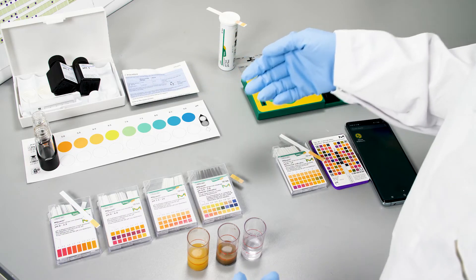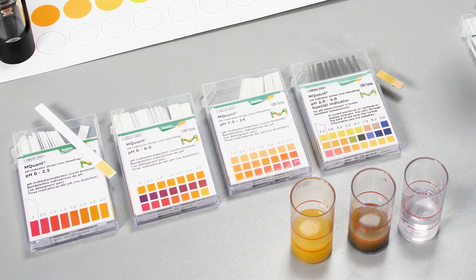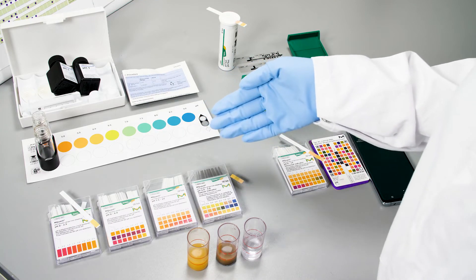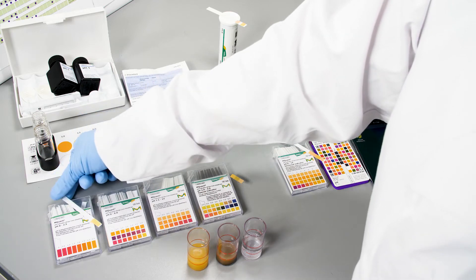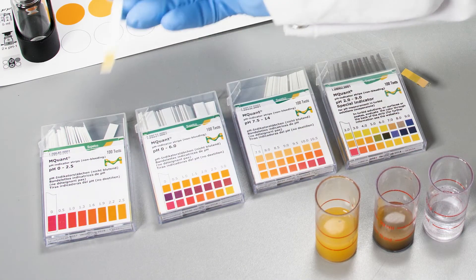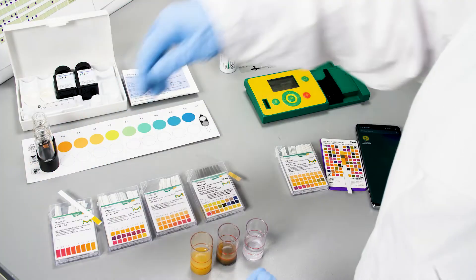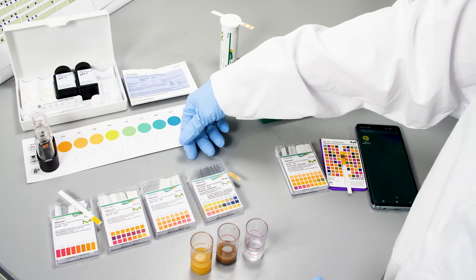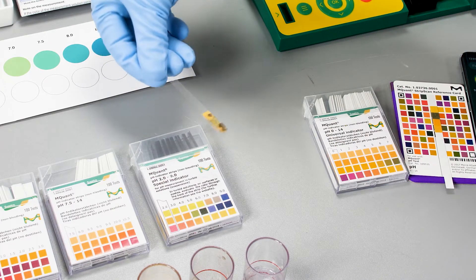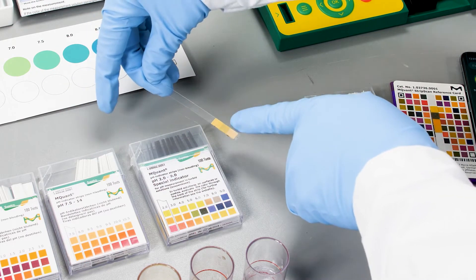If you're looking for a very easy and simple solution to test your pH very fast, Amquant test strips and papers may be a suitable option for you. It is especially noteworthy that Amquant test strips are non-bleeding, which means they do not transfer any chemicals from the test-strip into your sample. You just dip your strip in your sample and then compare the color reaction with the given colors on the box. Noteworthy is that when you use extremely turbid or inhomogeneous samples that are clouding or making the test-strip dirty, you can flip those test strips over and still compare the sample.